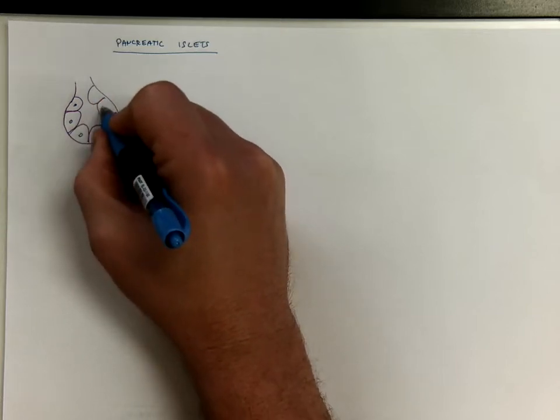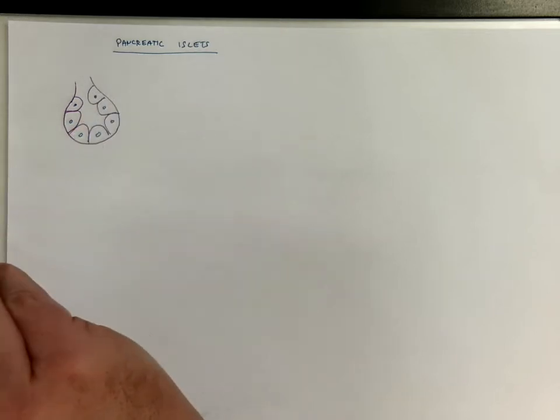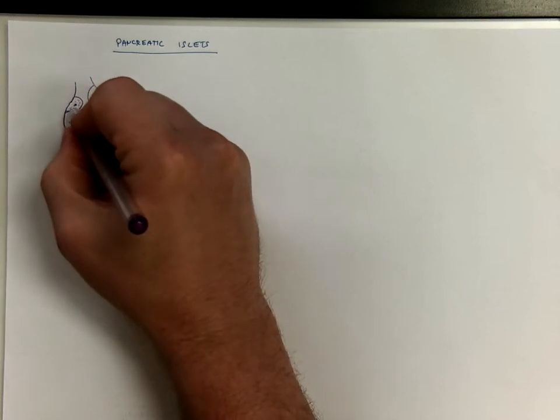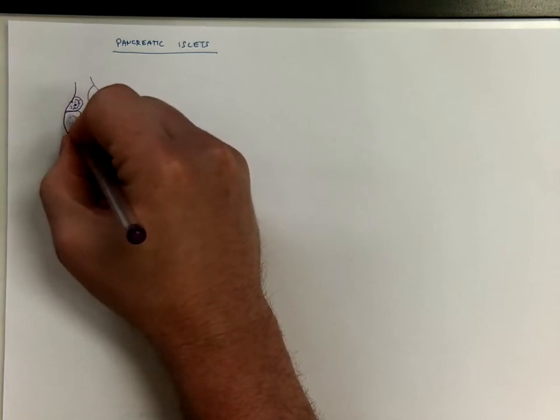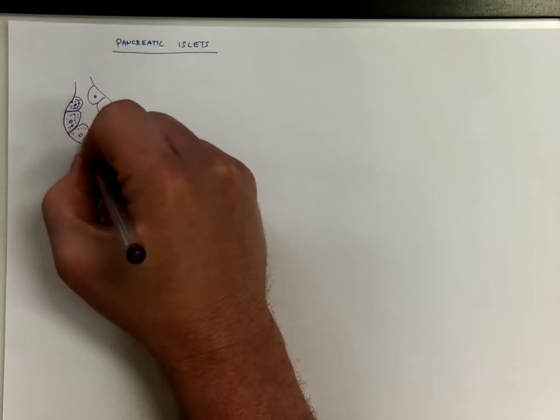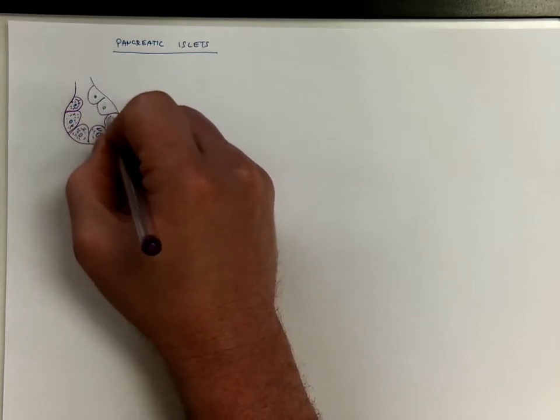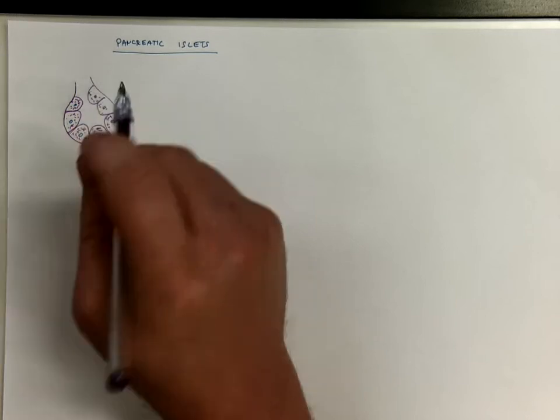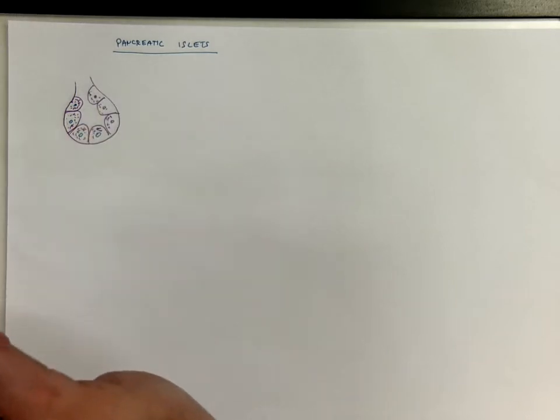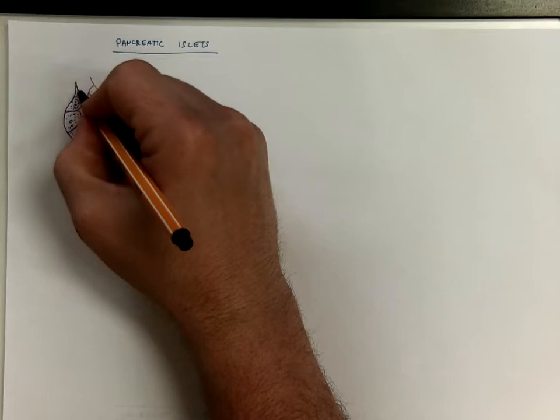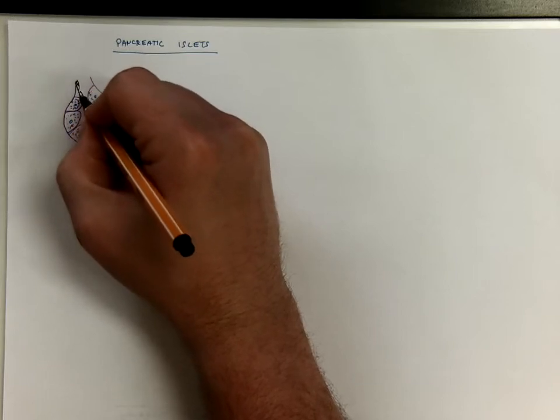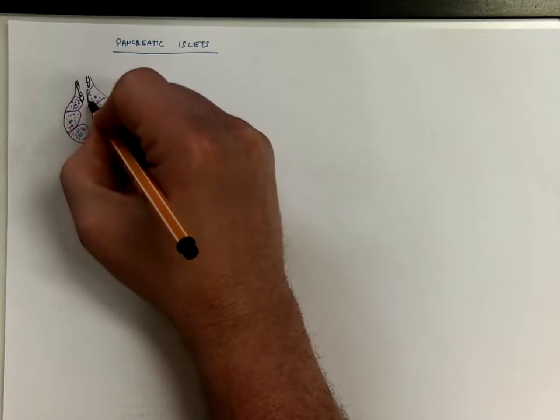These are basophilic cells that are specialized for producing proteins with the zymogenic granules here and centroacinar cells come from the intercalated ducts here.